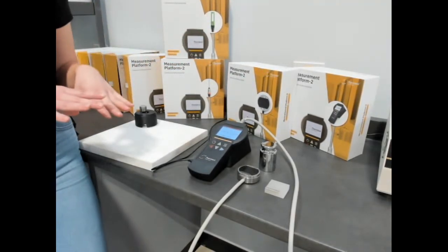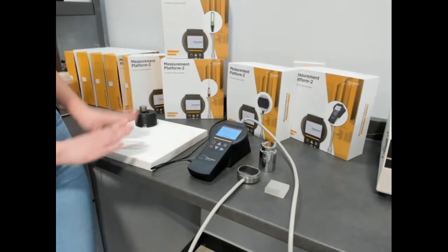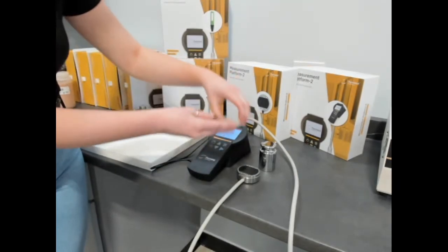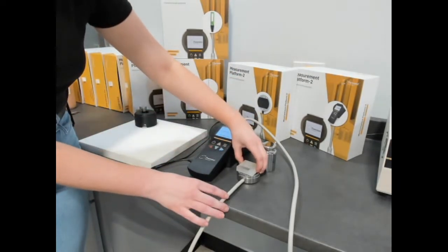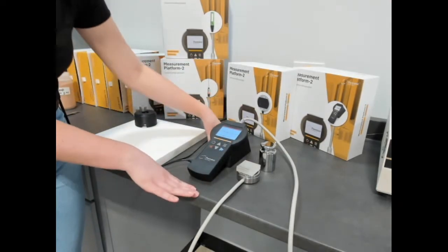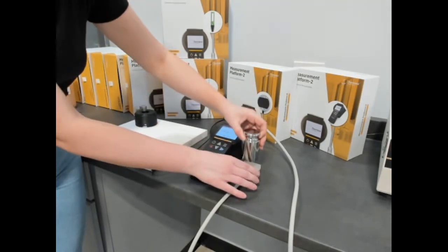Today we're just going to be running single measurements for the purpose of this demonstration. To set up a measurement, we're going to take our sample of polypropylene and place it on top of our TPS4 sensor, making sure to center it and ensuring the sensor is in a stable environment, and then place our one kilogram weight on top.